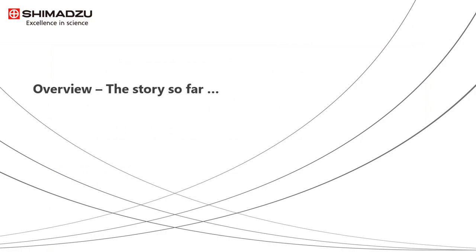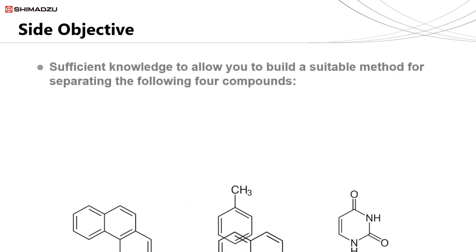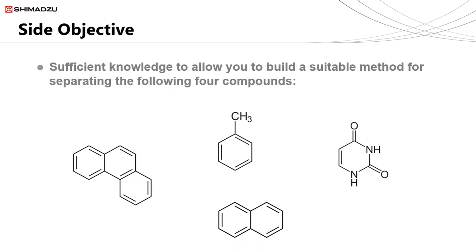So we will begin today's overview session. We have, over the course of the last 4 sessions, provided enough information for you to start to think about building your method. We would like to use the following 4 compounds to start to talk about how what we have learnt so far will allow us to develop a method, which we will then expand upon in our future series.